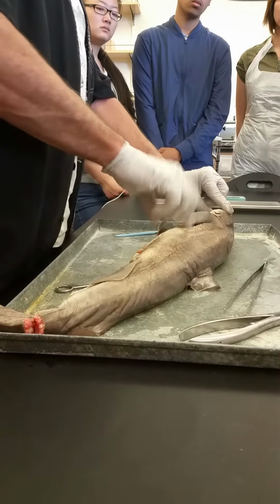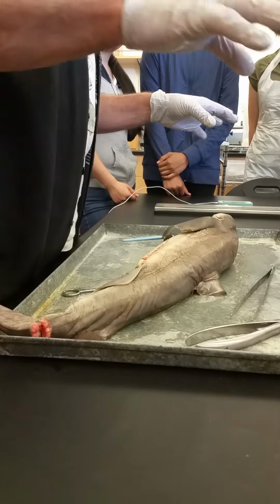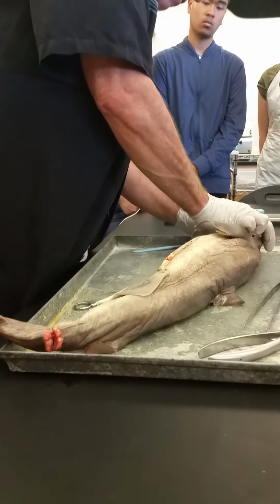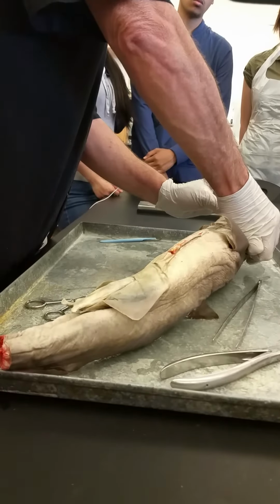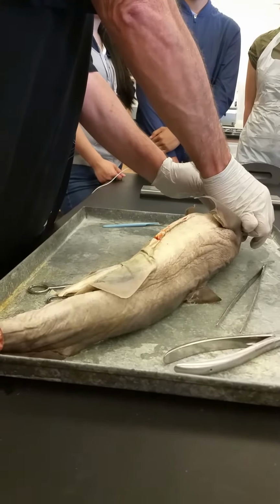And that's one of the reasons why the fossil record of sharks is so good, because there's layers and layers of shark teeth. Sharks have been shedding teeth for as long as there have been sharks. And there's lots of, again, variation in structure. So these guys are mostly feeding on things like small fish and squid, so they have little sharp pokey teeth for grabbing onto squirming prey and swallowing them whole.